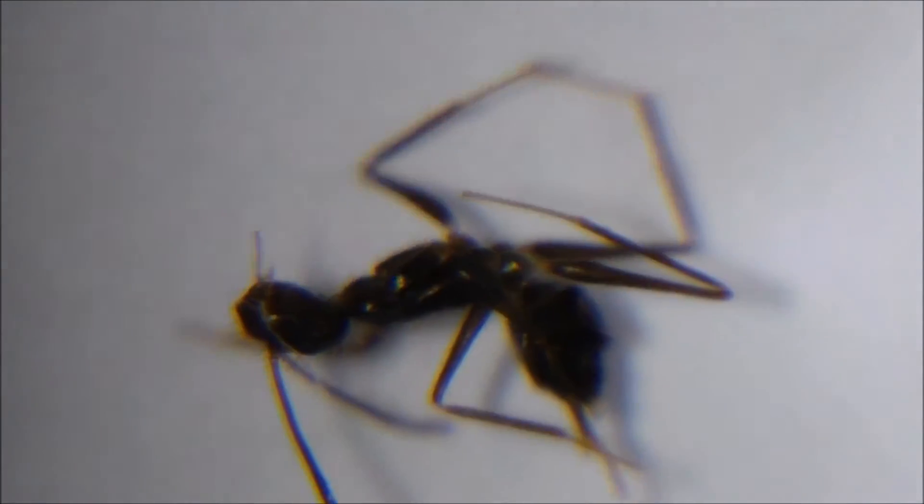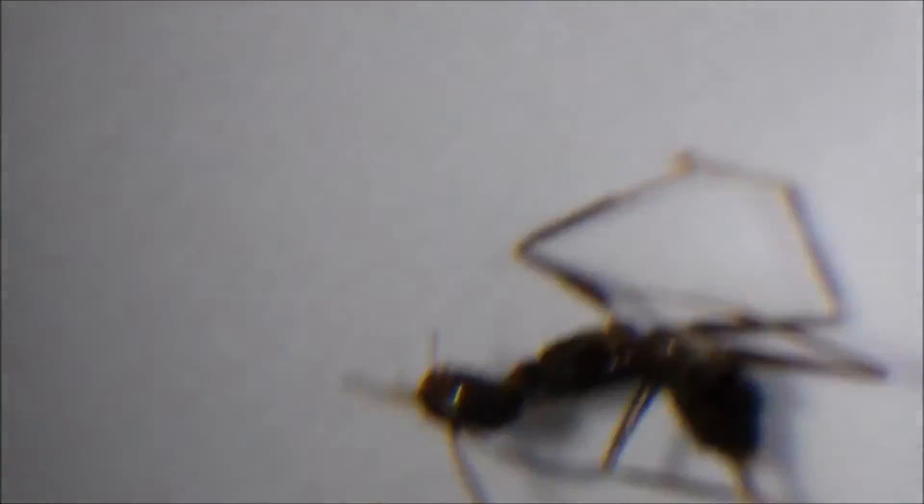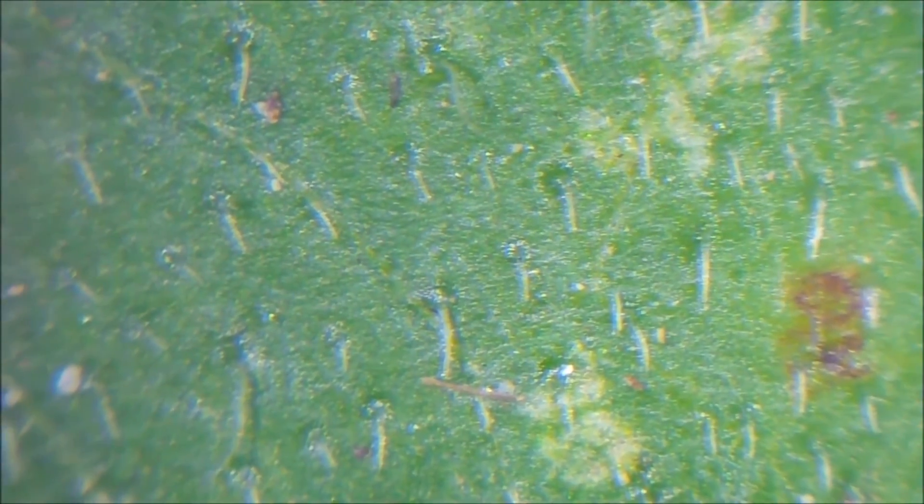So again this is a test of the Samsung Galaxy S4. It's pretty interesting. Let's look at a leaf. Well that is better than I would normally be able to zoom in on. So that's actually pretty good. I'm actually just resting it on the leaf — I'm not holding it up at all. So let's try to do the same thing with the ant.